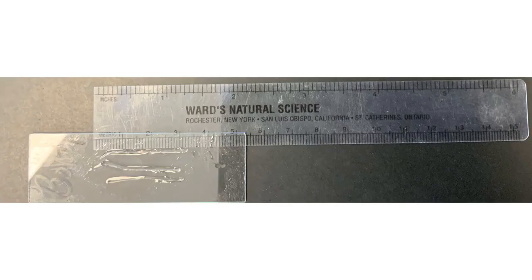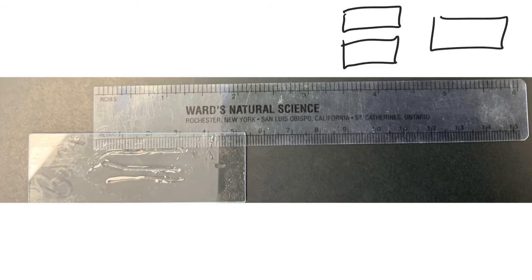So then you would have put it on, as you can read through the experiment, you would have 3 microscope slides. One would be ATP, one would be salts, and then the other would be both. And you put 3 as small of fibers as you could get on each one of those slides, and then measured the length. So you can see this slide was made up, and I was trying to go quickly because we're getting kicked out of the lab, let's be honest.